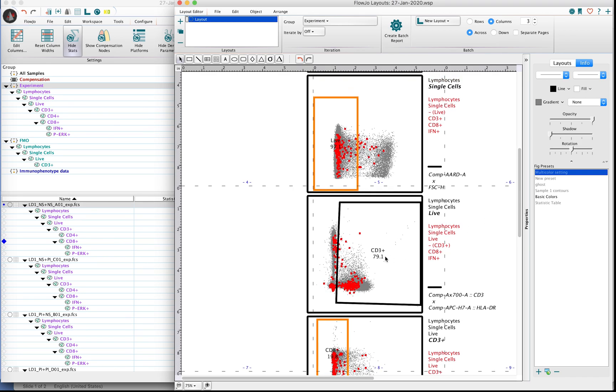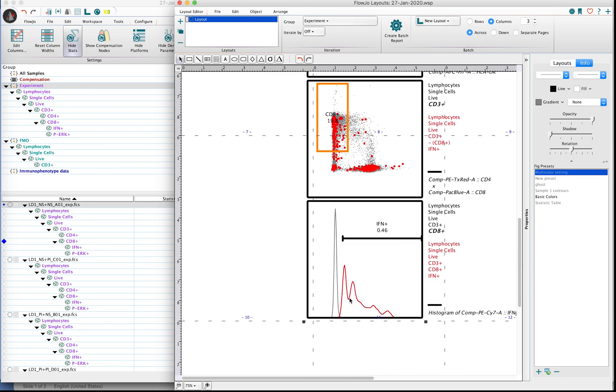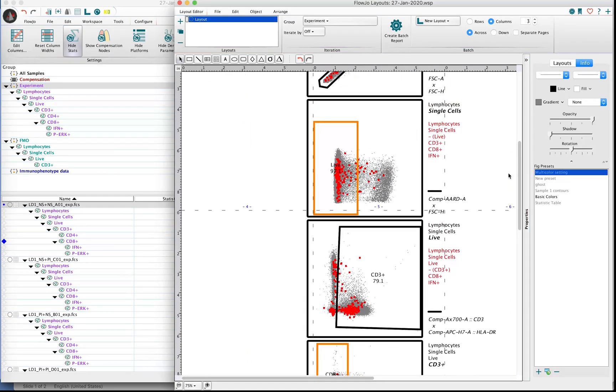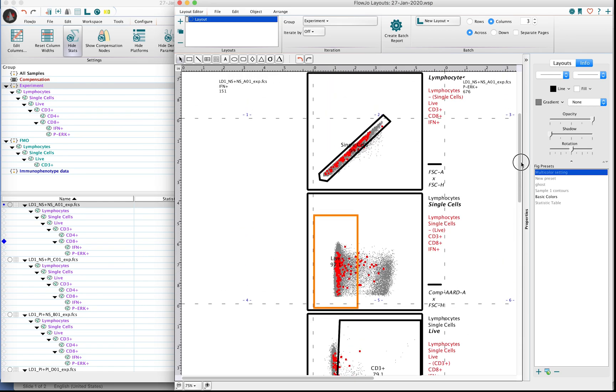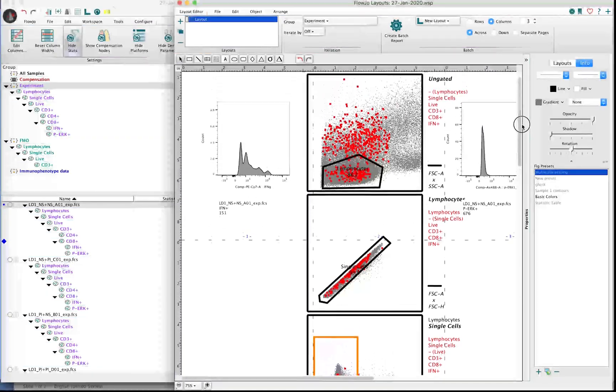Same thing can be witnessed here. When we look at our gate for CD3 positive cells, you'll notice that there are some CD3 negative cells that express interferon, and we're obviously ultimately not interested in them falling into this terminal gate. But this backgating tool allows us to see that, yes, there are cells that express interferon that are not T cells in my mix.